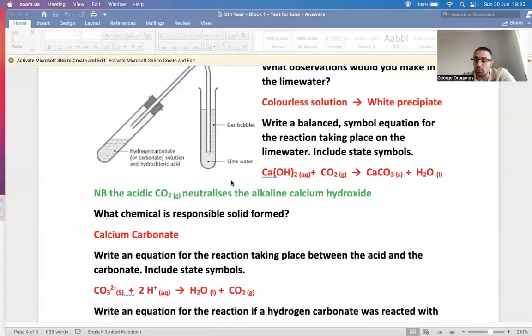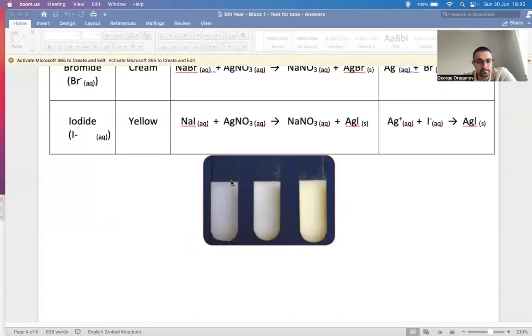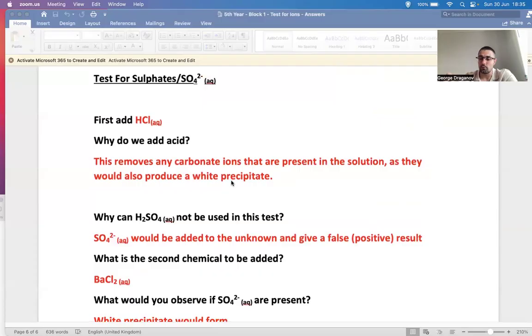So with that done, we move on to the sulfate test. The sulfate test is the one you should do next. Now, you're testing for SO4 2-. So first of all, you obviously cannot use sulfuric acid because then you'll introduce sulfate ions. Okay, so you can't do that.